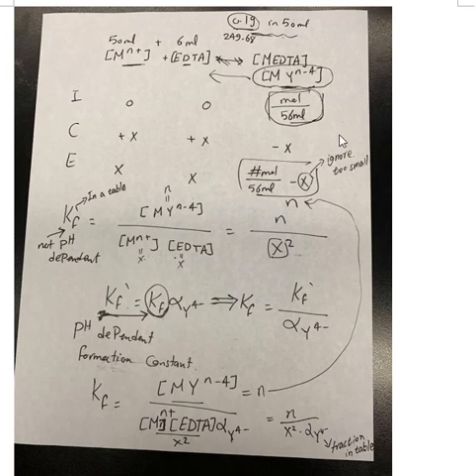So in this lab 2, we will use a metal to react with the EDTA. The EDTA goes to the burette. It's a titration. So in the end, we get a complex. This metal-ligand complex is a chelation, and in this case, we first assume we use 6 mL of EDTA, but you use your real data. After this lab is done, you should have your own data.